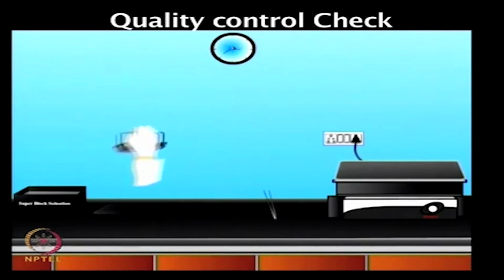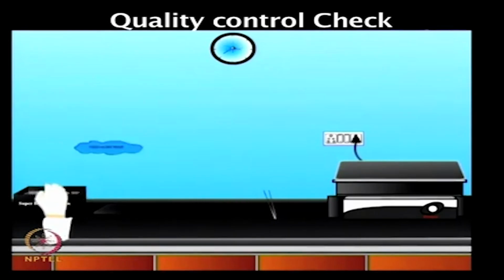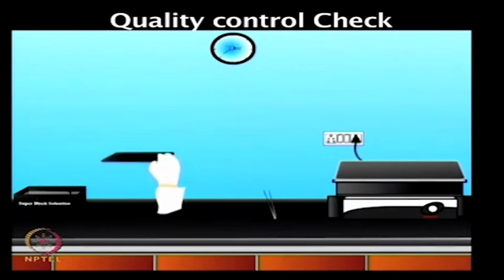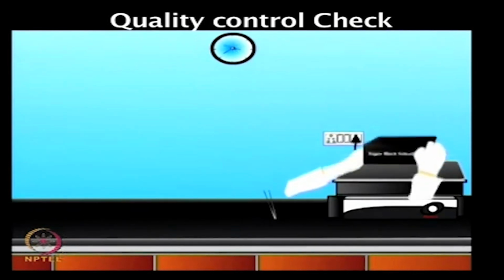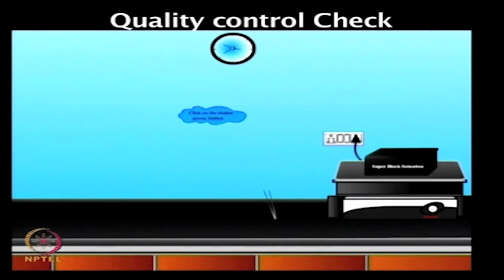The storage form of NAPA microarrays is merely DNA. So, in an activated array, all following reactions elapse in solution and in real time. Therefore, restrictions caused by the instability of proteins occur very rarely.